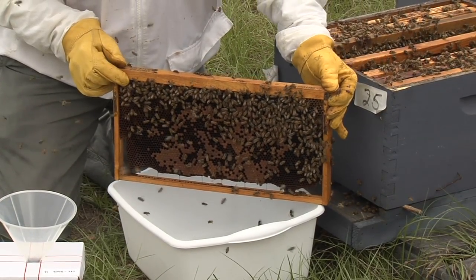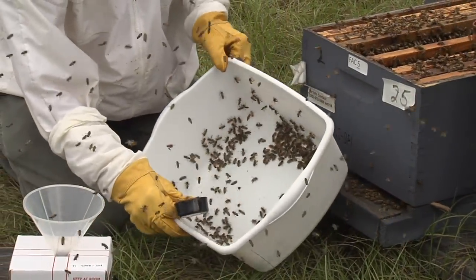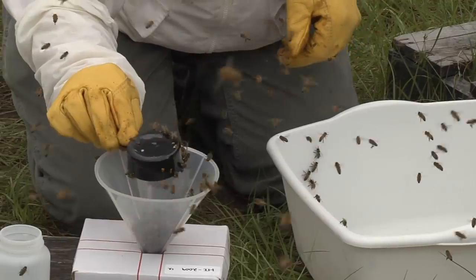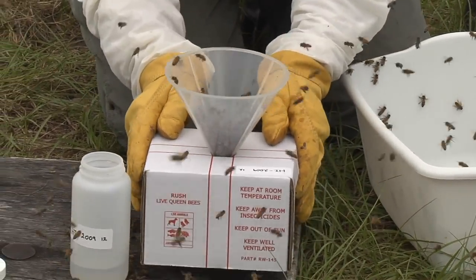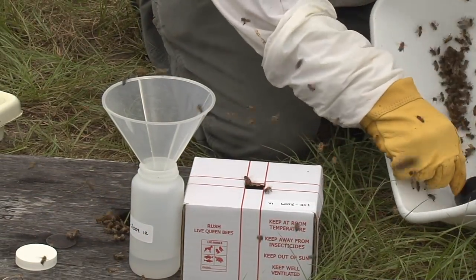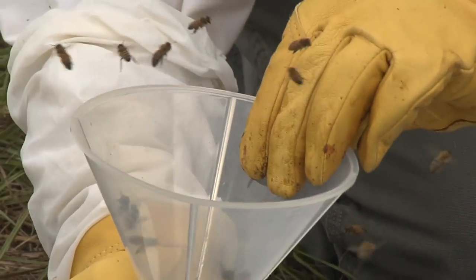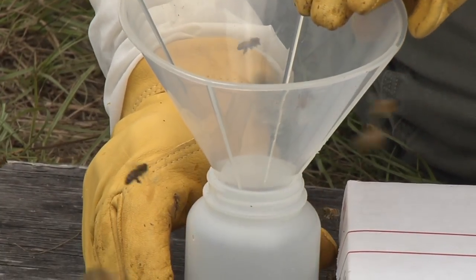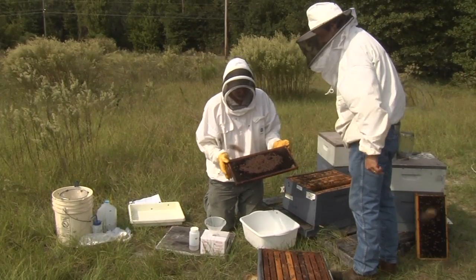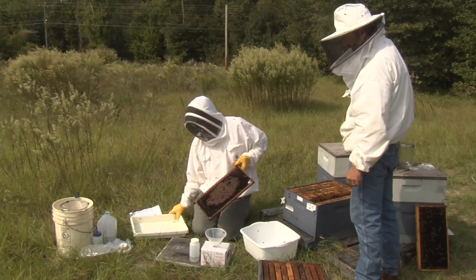Shake bees vigorously from the frames into the wash tub. Bump the wash tub to gather bees into one corner of the tub. Scoop one quarter cup of adult bees into the funnel inserted into the lid of the live bee shipping box. Gently tap the box to force the bees from the funnel into the box. Scoop a second quarter cup of bees from the tub into the funnel that is now inserted into the large bottle containing alcohol. Tap the bottle and funnel to force the bees into the bottle. Once the two samples are taken, you can return any leftover bees to the colony. Check the frame and shake it again over the colony if a large number of bees are clinging to the comb.